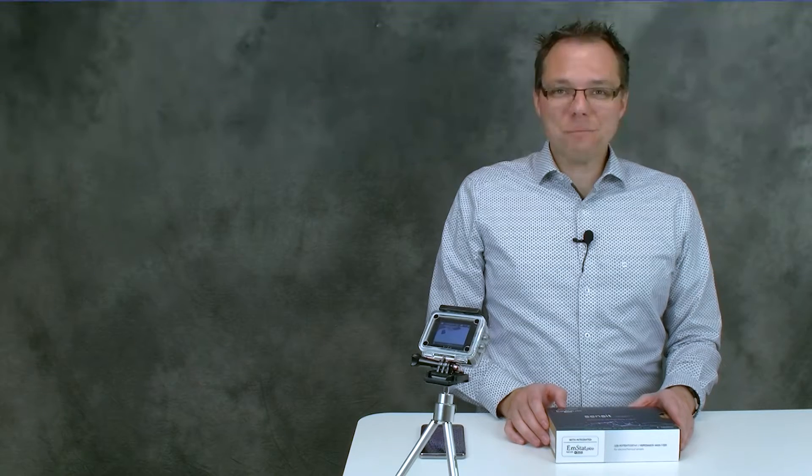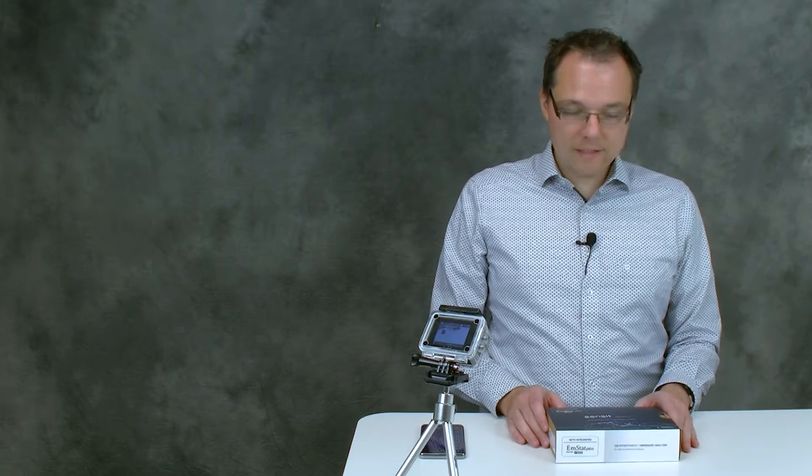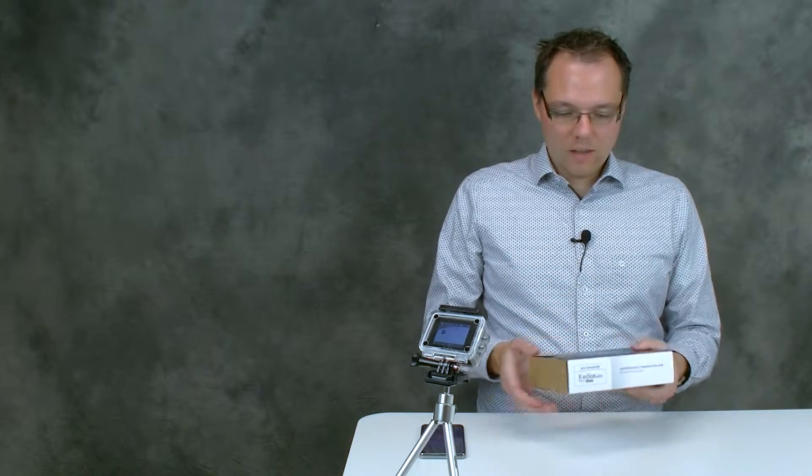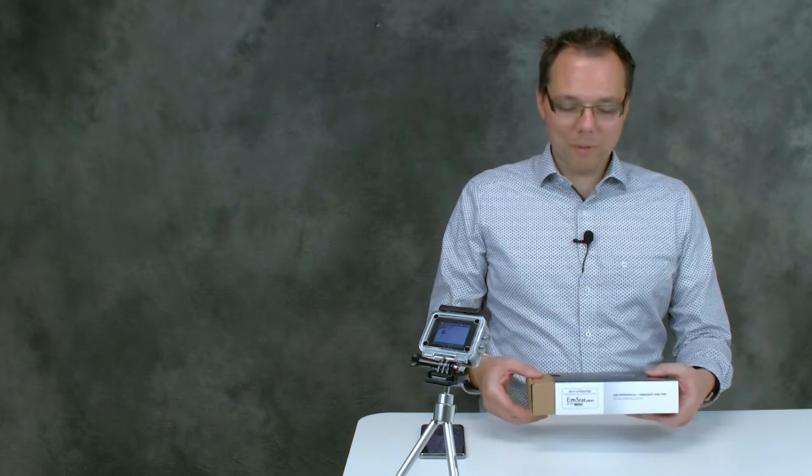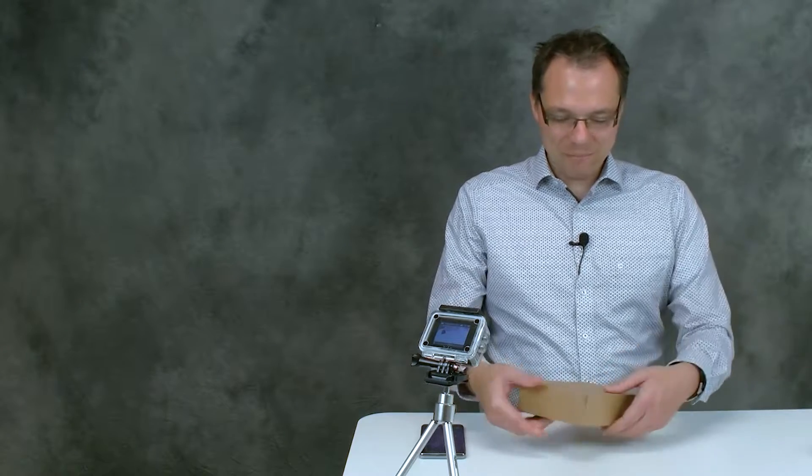Welcome to this PalmSense unboxing video. Today we're going to look at what's inside the box of a Sensit Smart. This is not like our big plastic cases. This is really like a carton box.